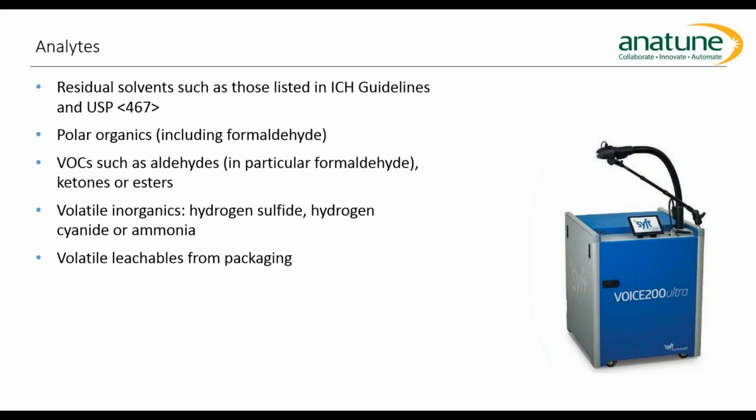I mean, there's other issues at this point in time, looking at the volatile nitrosamines in drug materials, which is currently a bit of a vogue issue. So there are needs for these sort of volatile type analyses with pharmaceutical products. And last but not least, volatile leachables from packaging.